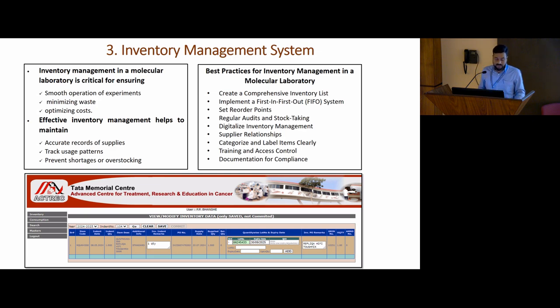To maintain this management system, we have best practices for inventory management in molecular laboratories, which include creating a comprehensive inventory list, setting reorder points, regular audits and stock taking, training and access control, and documentation for compliance. These are some of the best practices mentioned in this presentation, and we have an in-house inventory management system. We have software, and we use this inventory management system for our molecular daily routine.